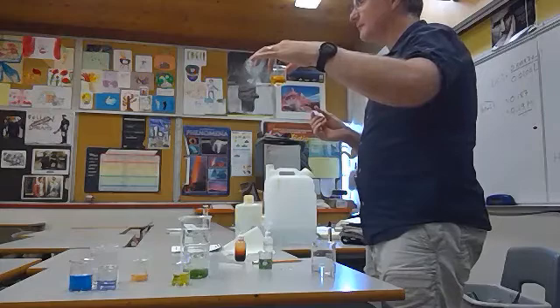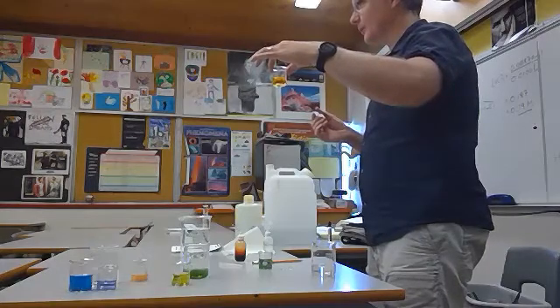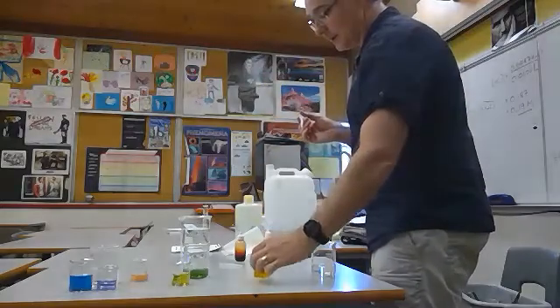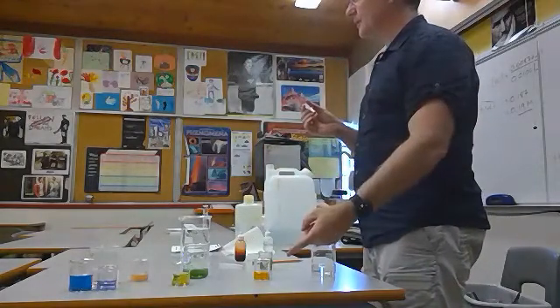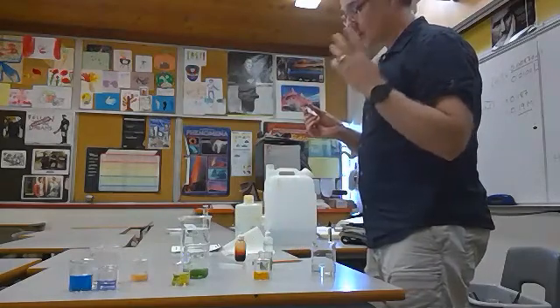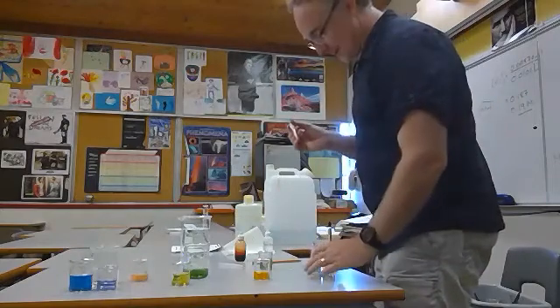So that's 5 pH units difference, which is 10 to the 5 times more acidic now, in a single drop, right? Which is why I really should be wearing eye protection, because that single drop, if it were to enter my eye, would do the same thing as it's doing to that beaker, probably more so because there's less fluid in my eye. And so this is why you should always wear safety glasses, which is what I'm doing right now. So anyway, I'm trying to be safe.